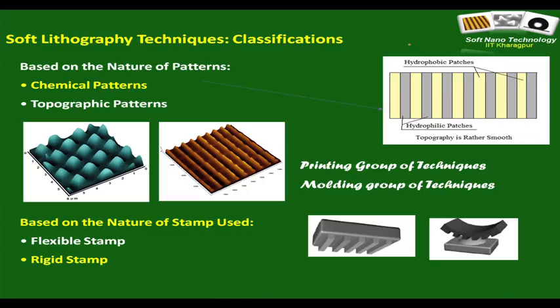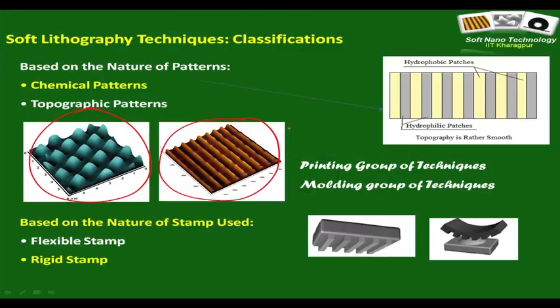But before I move on, I would just like to draw your attention to one unresolved topic which we discussed during our discussion on soft lithography, and I have just borrowed this slide from our lectures on soft lithography. So now all these images, in fact, you understand these are all atomic force microscope images, and you also understand whether it is green or brown doesn't make any sense, because all color in an AFM image is artificial, because it's only the color base you choose when you convert your data into the grayscale that in fact matters. In fact, both the images, to be honest, are incomplete because none of them comes with the vertical scale bar, and therefore when I was rendering these images, I missed out vital information about the height of the structures.